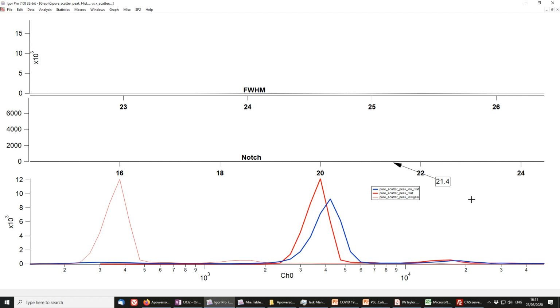And so we plot these distributions, and what you want to know is essentially what is the center of the distribution. And the quick and easy way of doing that, which you might do in the field maybe, is you take this little box with an arrow on it, you hold down Alt, you hold down left click, and then you drag this to the peak position.